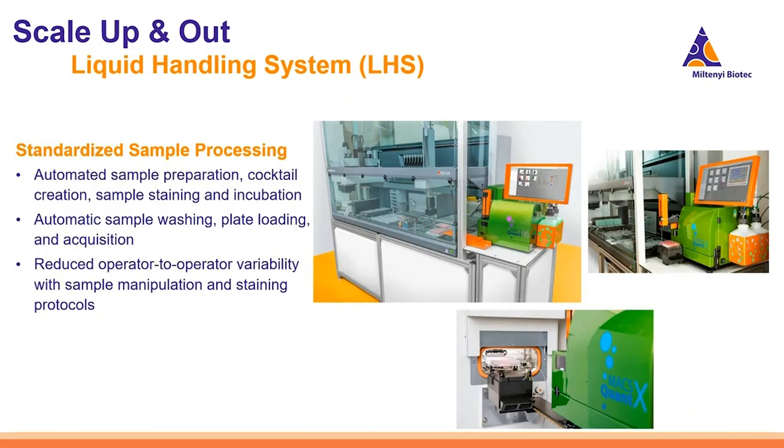Another method to really reduce subjectivity is to incorporate some sort of liquid handling system. As you can see on the right here, this is an example of our MACSQuant flow cytometer connected to a liquid handling system. This can automate things like sample prep, your cocktail creation, sample staining and incubation. It can even automate sample washing, plate loading and acquisition, as some do have a built-in centrifuge and incubator.